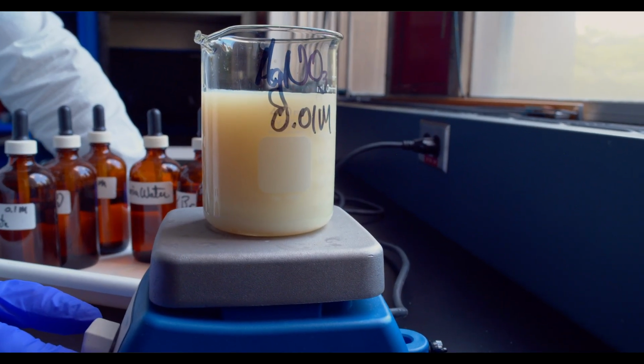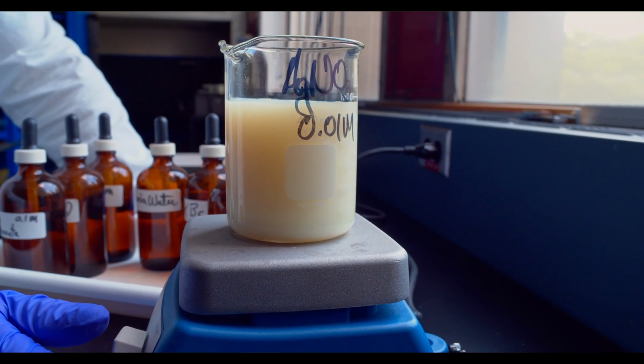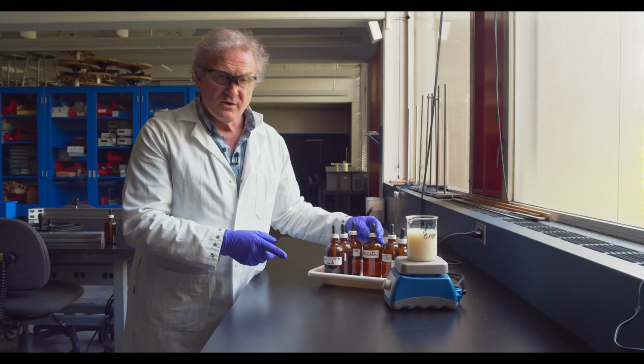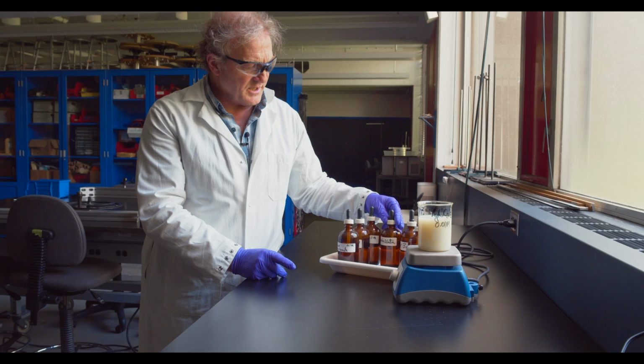If we had a hood, we could next add sodium EDTA, ethylenediaminetetraacetic acid. That would dissolve this, or potassium cyanide solution, which would also dissolve the silver iodide.